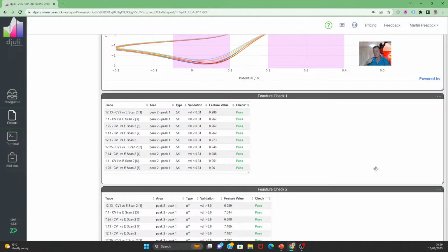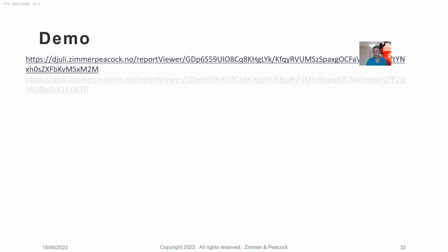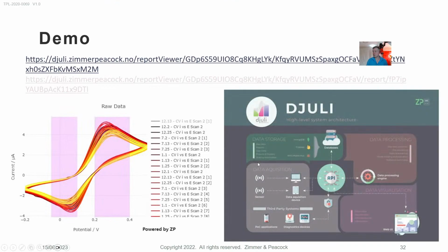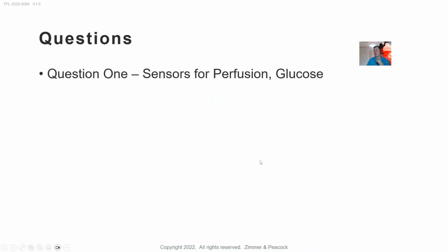But just know that we make them for ourselves and we offer them on the web store as a service. Whether the standard deviation, the way we measure it, between sheets and within a sheet, is applicable to you, that's not something we're saying, because we would have to test the electrodes in exactly the way that you were otherwise intending to use them. But we do a lot of testing. We do sheet testing, and within sheet testing, and we can process the data very quickly.